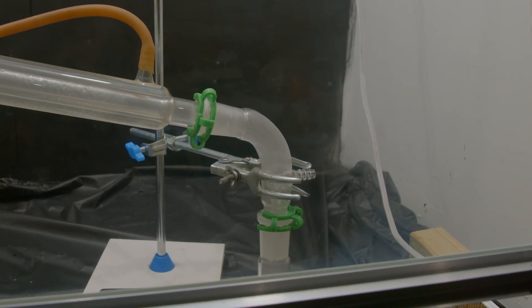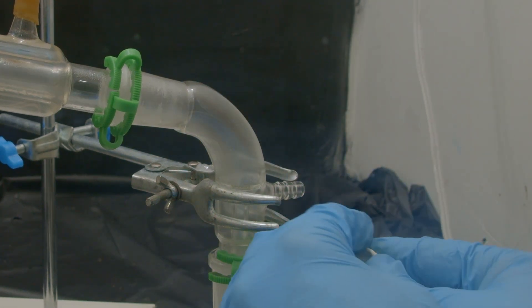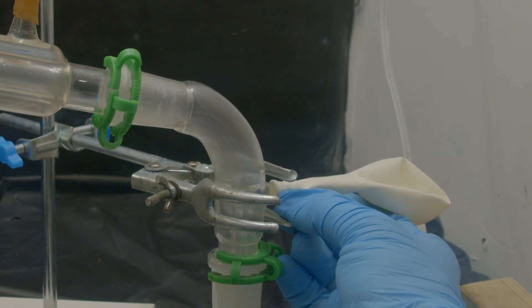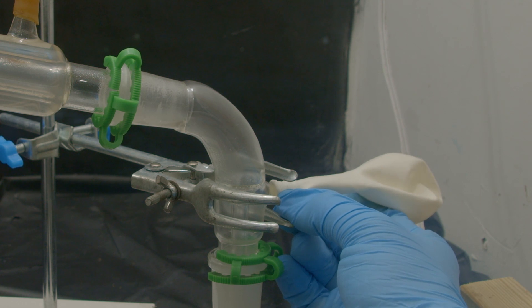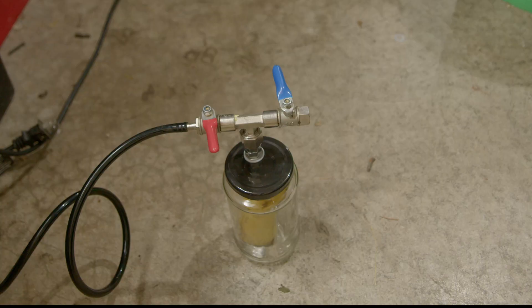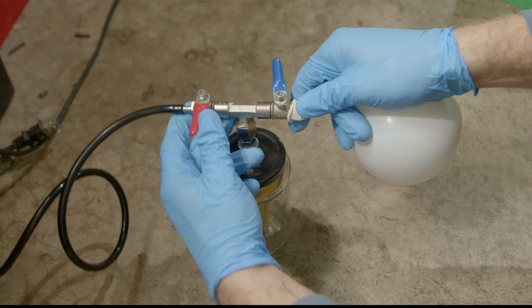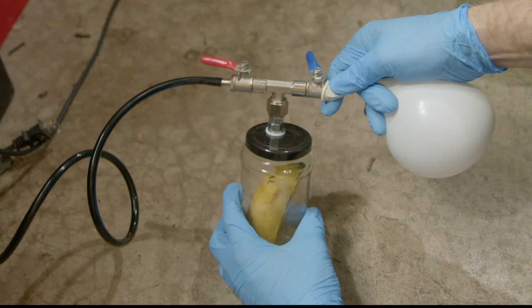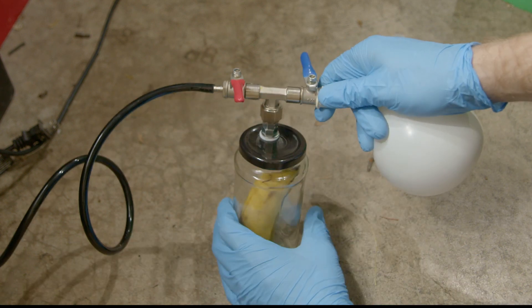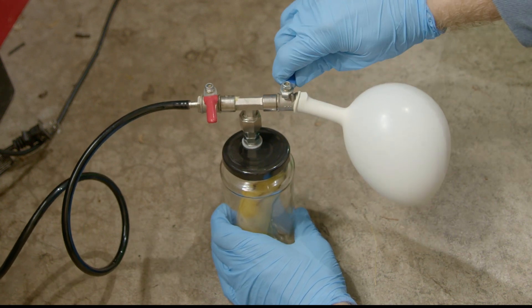I got it too hot and it started smoking, but that actually helps us see the ethene coming out. So I go ahead and put a balloon on it and try to fill the balloon up as much as possible. Once I got a good balloon full, I do some gymnastics to get the ethene gas into the jar. First I let the vacuum in, which pulls all the air out of the jar, then I carefully repressurize the jar with ethene gas.